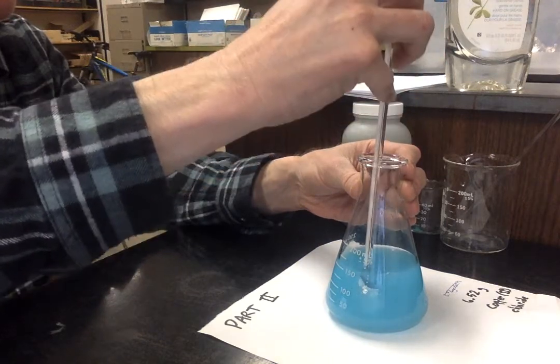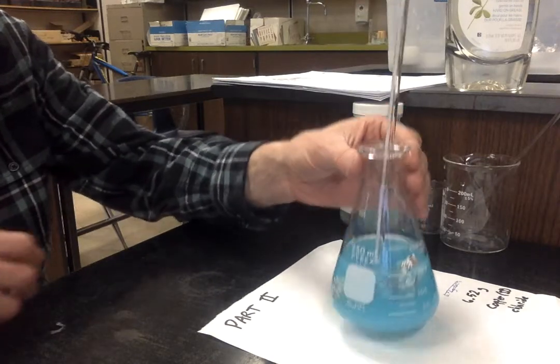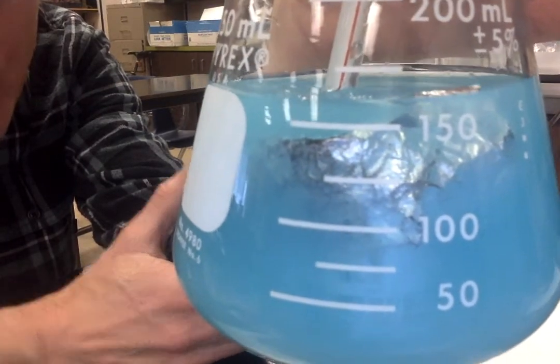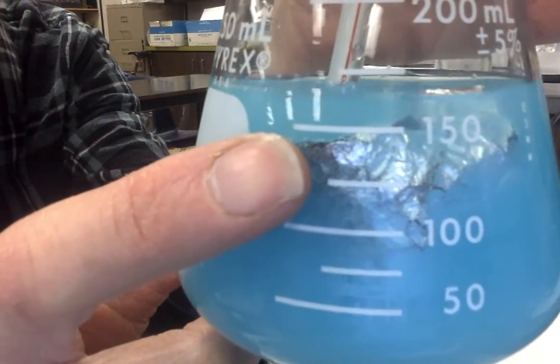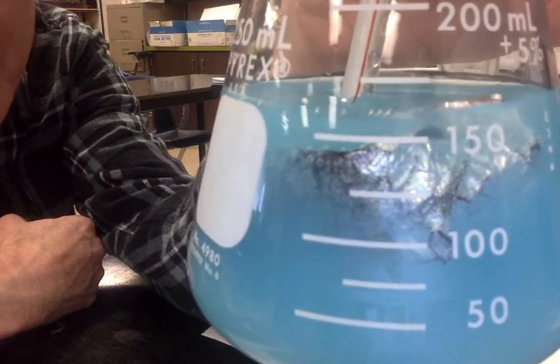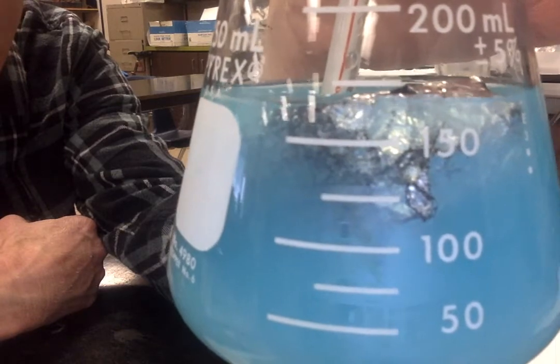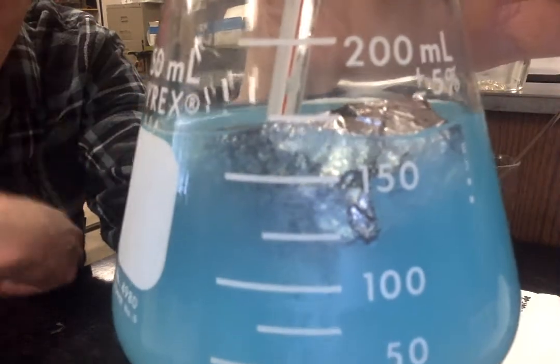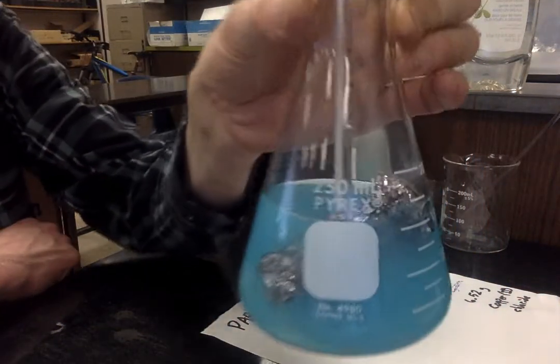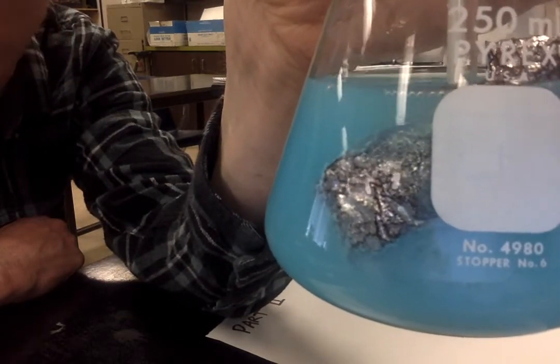All right, I'm going to push this in here a little bit, try to get some of that air out of the aluminum foil, and it started. The reaction is effectively instantaneous. I'll hold it up to the camera. Right here, you can start to see it turning a little bit brown. It's happening really fast. We've got bubbles being produced as well. It's starting to float, and it's covered in bubbles. Why do you think it will be floating when it's covered in bubbles? Notice the color change. It's turning a coppery color, a rich brown color.